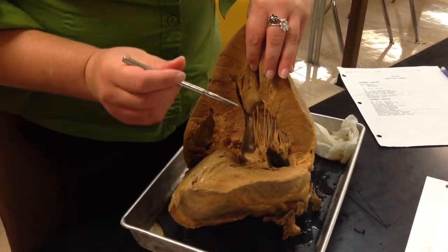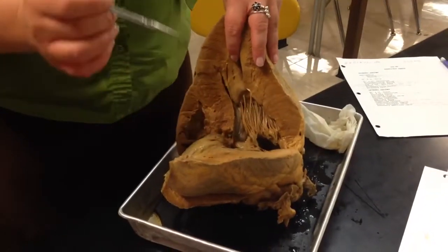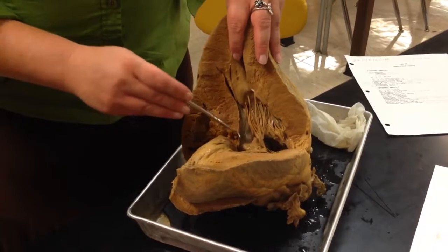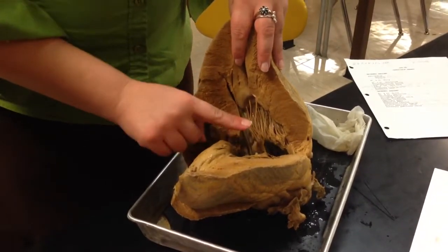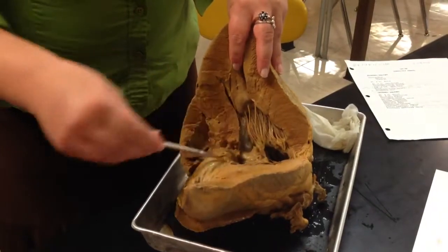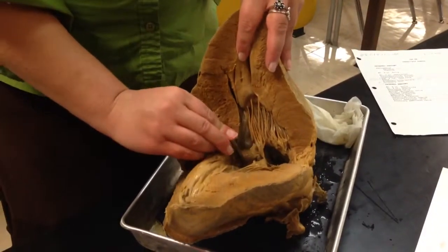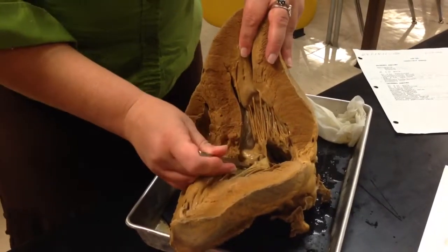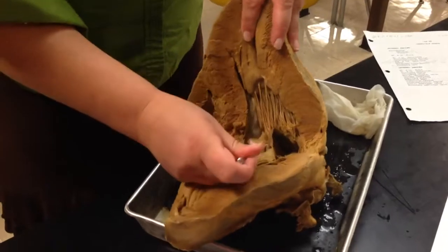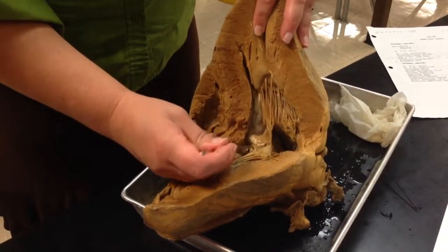The best way for me to think of this is what chamber you're in. So we're in the left ventricle, and according to your pathway of blood, what's the vessel that leaves the left ventricle? That's aorta. If he has a pipe cleaner going through a vessel that leaves the left ventricle, it's aorta. Then if you know that's aorta, you know that these little cusps here are your aortic semilunar valve. Right there, aortic semilunar valve.